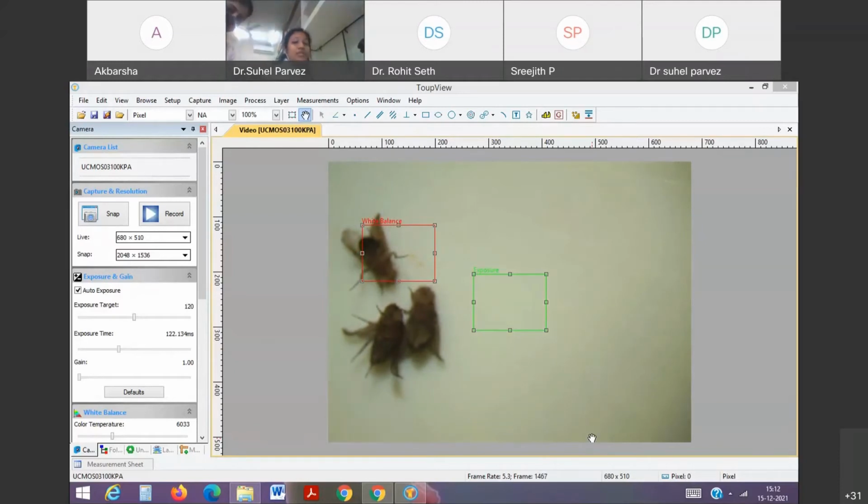Some of the flies have balancer chromosomes, and in the balancer chromosome we attach a physical phenotype. I've already told you the physical phenotype of wings, like curly wings. These are the actual curly wings of the flies. It has black eye color. We represent these flies as SP, DCO2, TM6B, CYO. This is how we name the flies with balancer chromosomes.